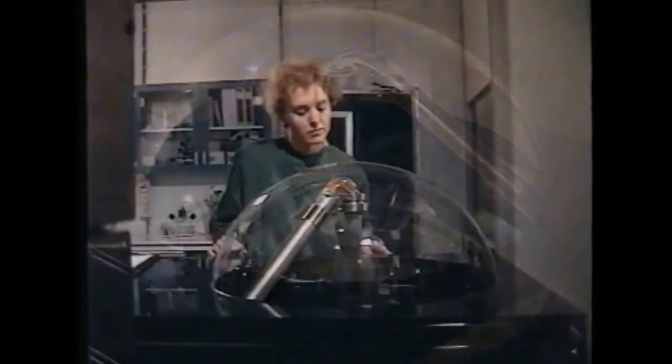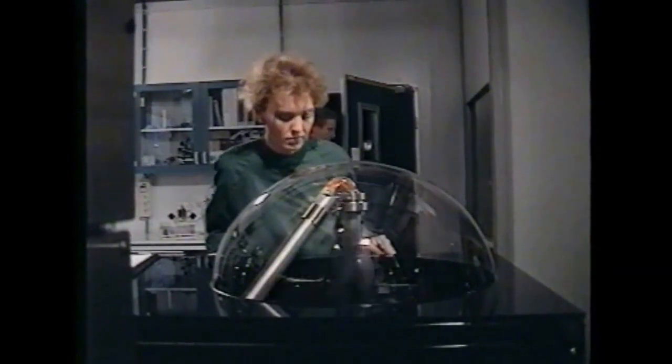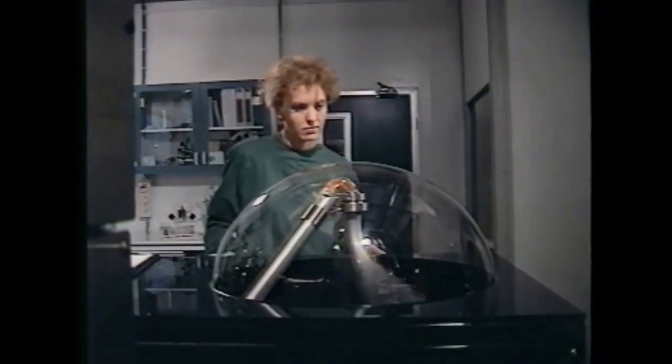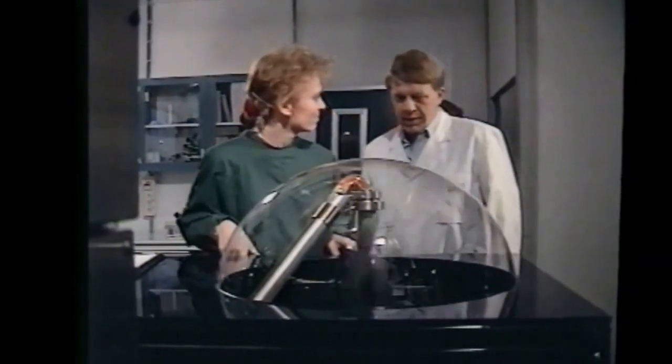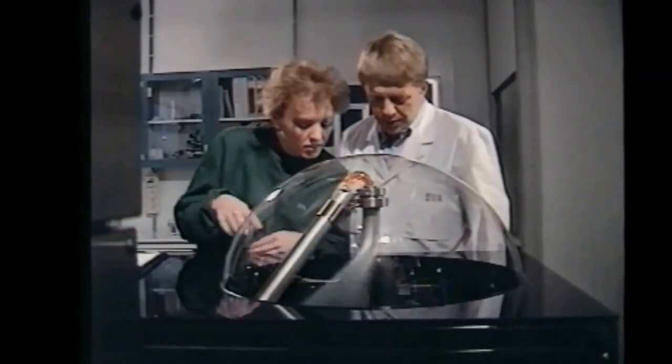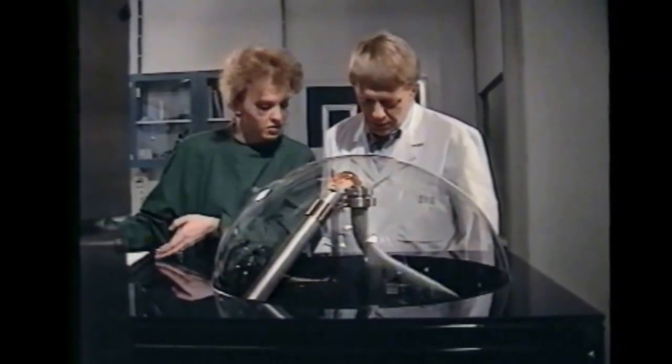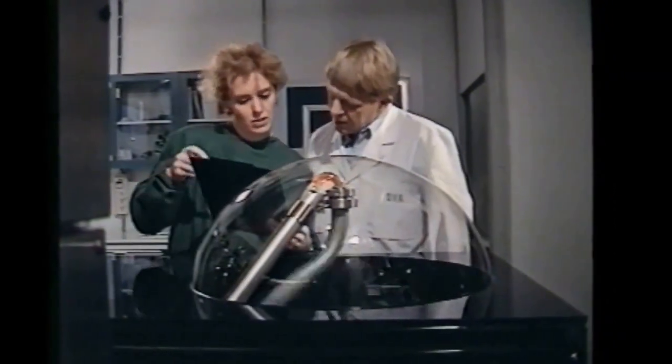As man strives to advance in the fields of medicine and modern biotechnology, mammalian cells play an increasingly important role in the production of vital substances such as vaccines, hormones, and monoclonal antibodies.